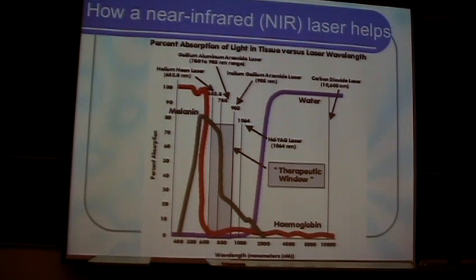The advantage of two-photon fluorescence microscopy and other nonlinear microscopy techniques that you will learn about later is that usually one can excite the dye molecules using this two-photon fluorescence process by using laser beams within the near-infrared spectral range, and you can see from this graph the biological transparency window.